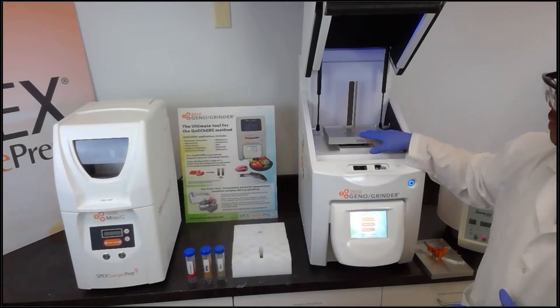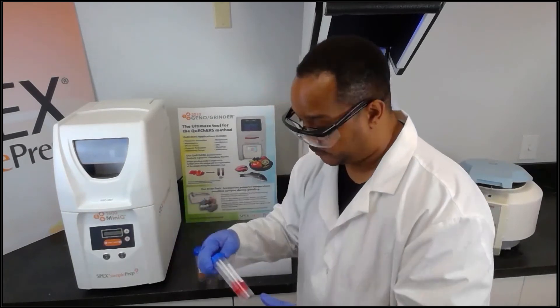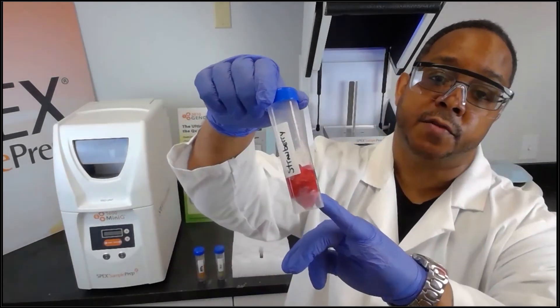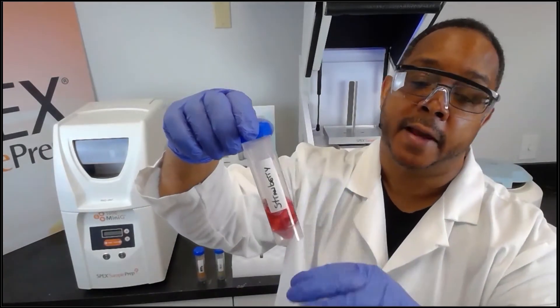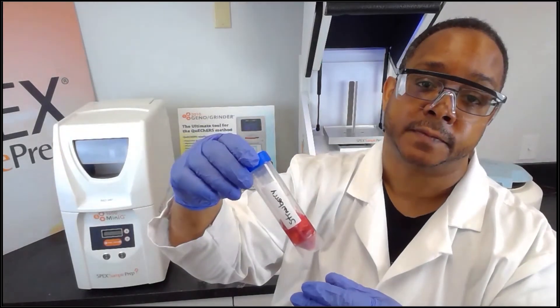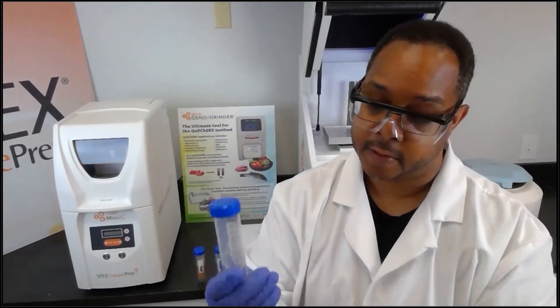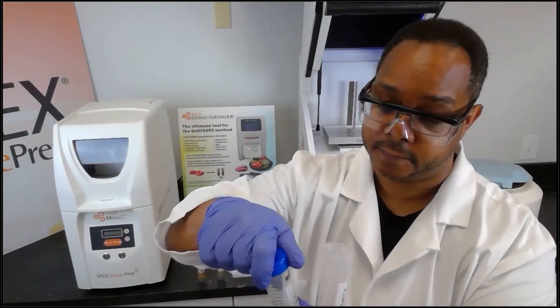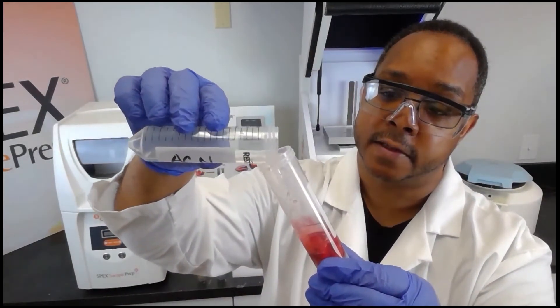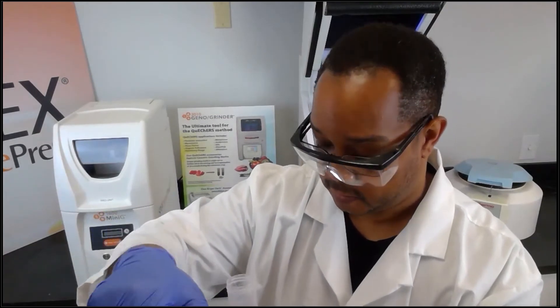You can vary your type of sample preparation based on container size. The fruit I have prepared here is already pre-chopped — here are the strawberries. The AOAC method requires 15 grams of sample and 15 milliliters of acetonitrile, so here I have the acetonitrile pre-weighed out and I'm simply going to add the 15 milliliters of acetonitrile to the 15 grams of sample.